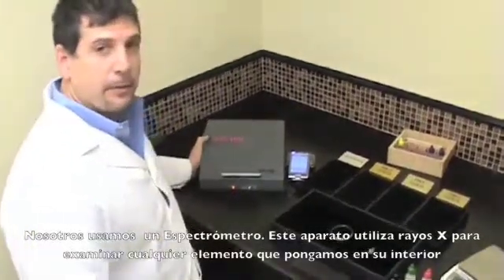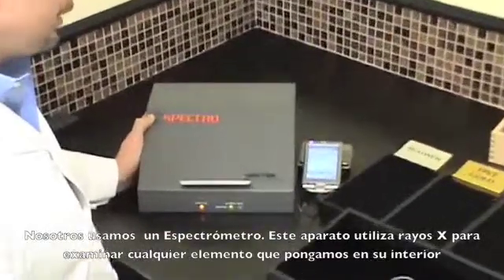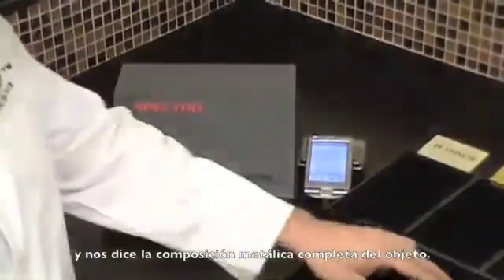We use a spectrometer and this device here is an X-ray device that will X-ray each item that we place in there and tell us the complete metallic composition of the item.